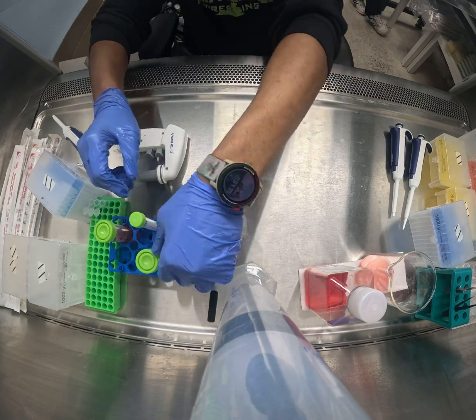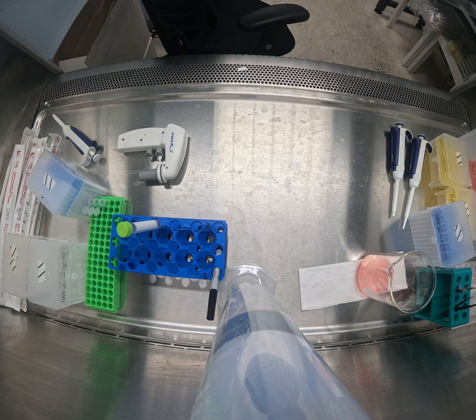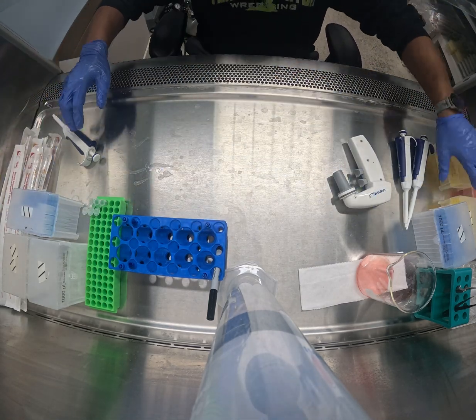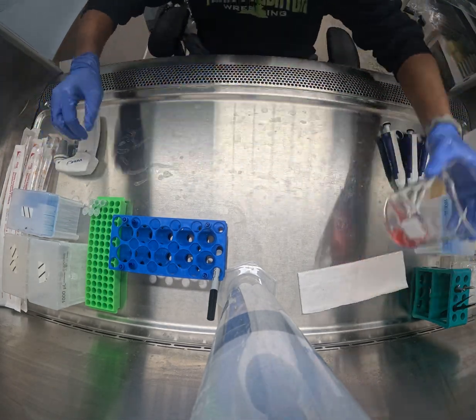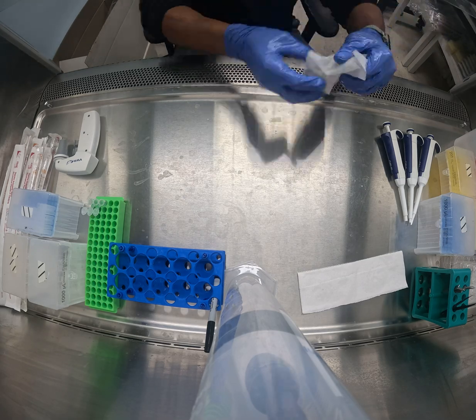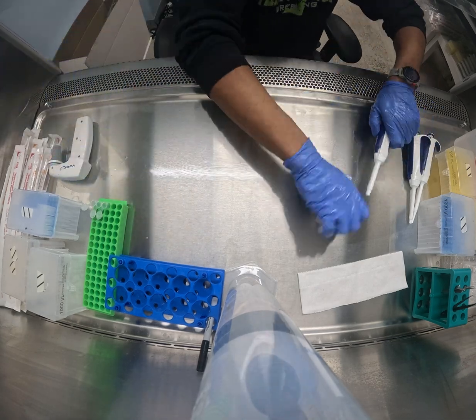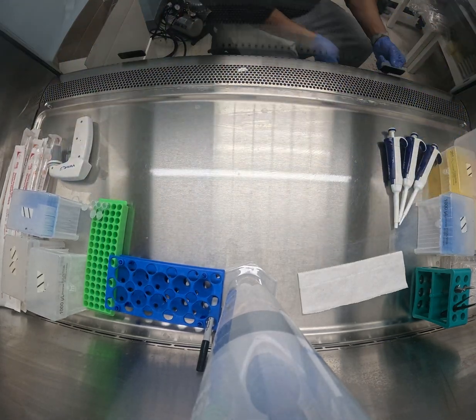After completing all passaging procedures, always clean and disinfect everything on your bench, leaving the area cleaner than you received it. Properly discard all biohazards in the correct bin and wash your beaker in the chemical lab. If you need it, label on our tracker the date that you passaged, the cells, and the type of medium that you used. Lastly, close the hood and turn on the UV light.